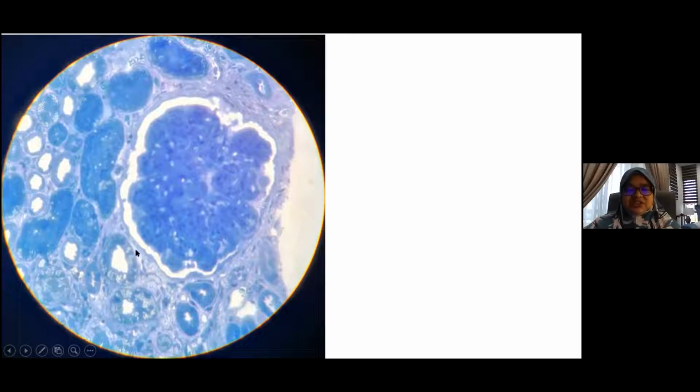This is the semi-thin section. The semi-thin section, by the way, is the section that we do after we process the tissue, after we resin block the sample, and we make some cuts, some sections. It's like in paraffin blocks, but this is from the resin blocks. So we make sections just to ensure that we have got the area of interest that we wanted, which is, we need to have at least 1 glom for assessment. Okay, so we got a glom in this tissue.